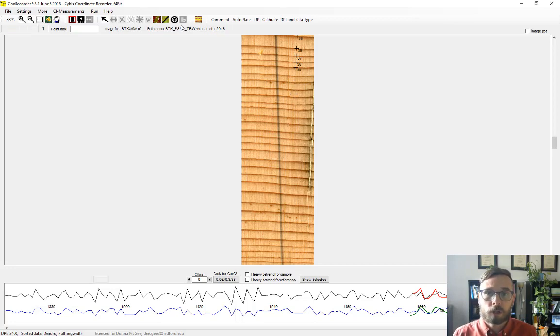I'll do another quick shift here by toggling this switch. You can also use your right mouse key if you need to, and that will toggle between single point and that shifting point type of data point method. So I'm going to actually shift across the line again, so I'll mark here, and then I will shift over here.